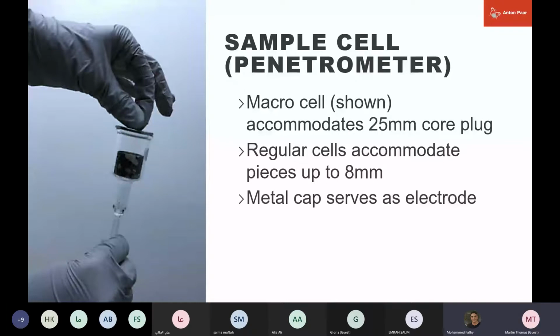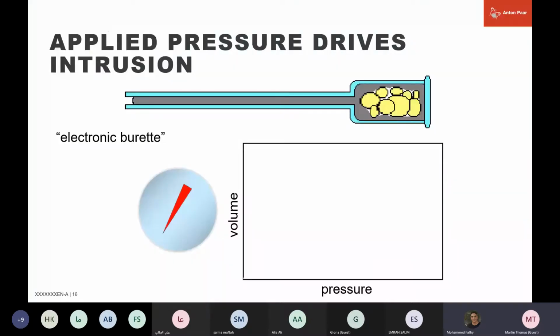Now, once the sample is in the sample holder and the sample holder is in the instrument, it's going to follow this process. Hopefully this will work. Basically, the mercury is filling the stem, and in this case, I'm showing some discrete particles. These might be cuttings, for example. At the starting position, maybe the mercury didn't even fill all the spaces between the cuttings.